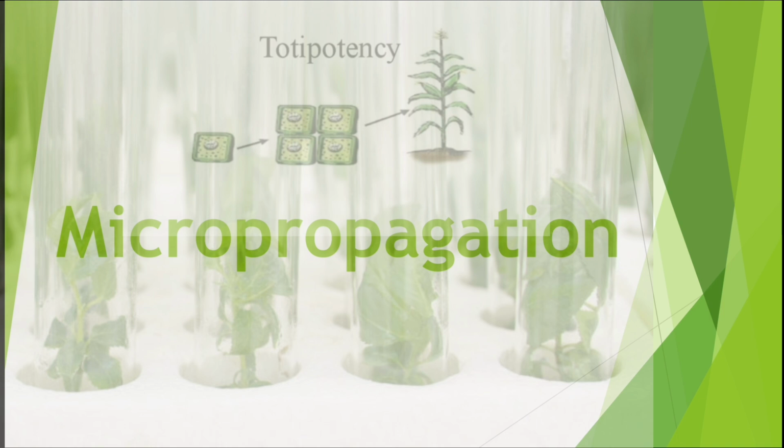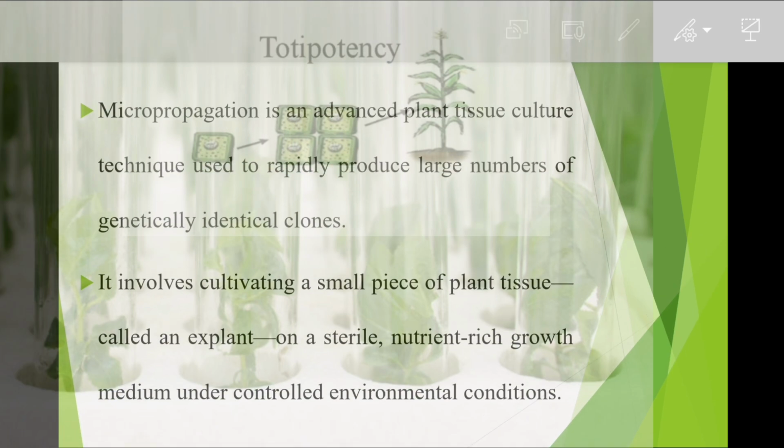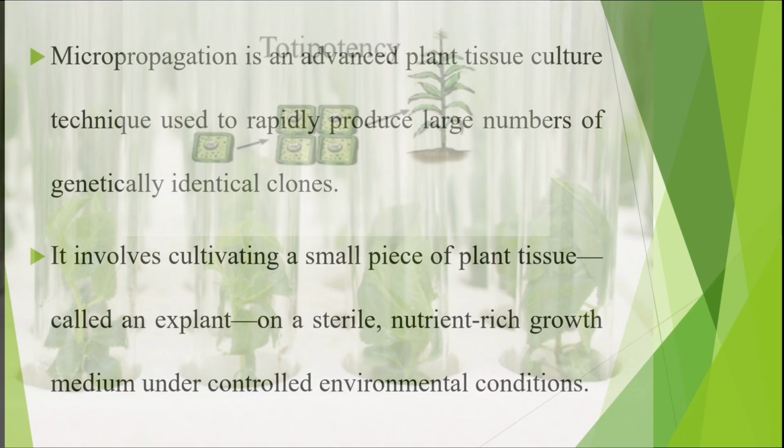In this video we will discuss the micropropagation technique. At first, it is a technique of advanced plant tissue culture.